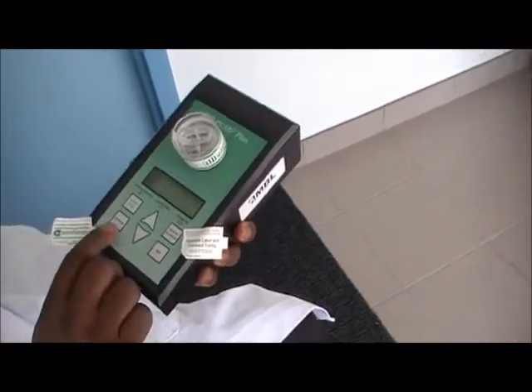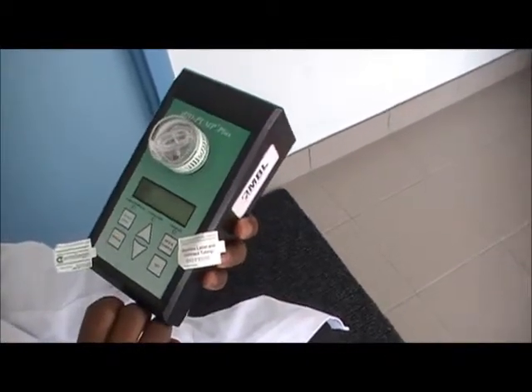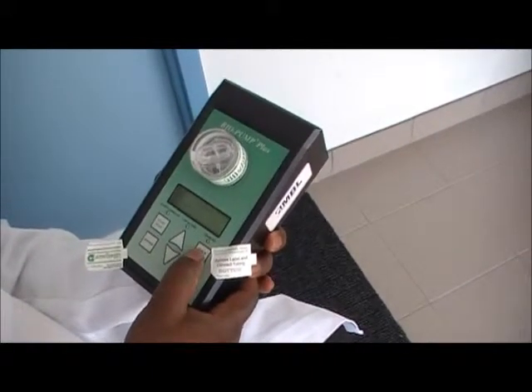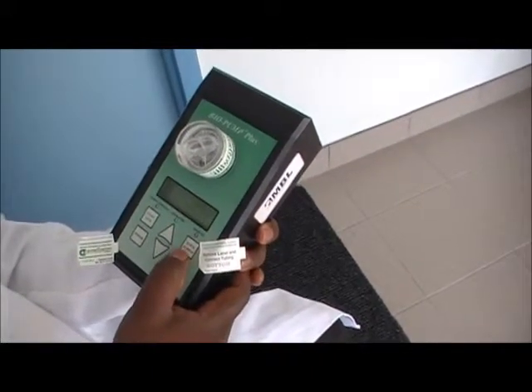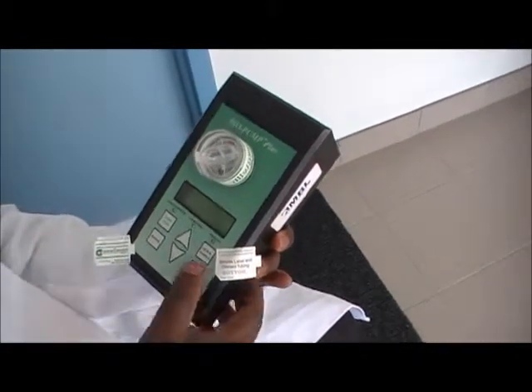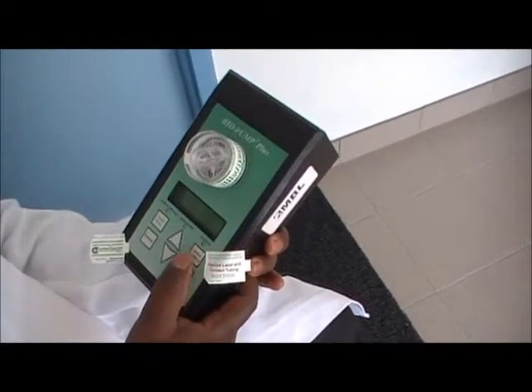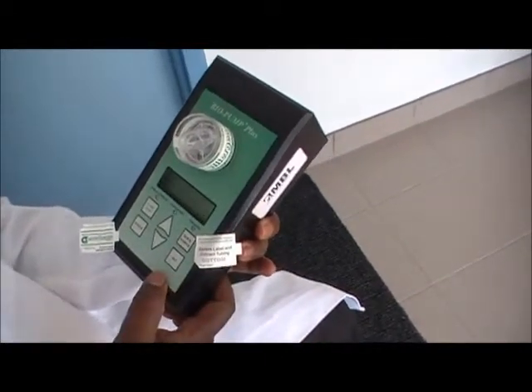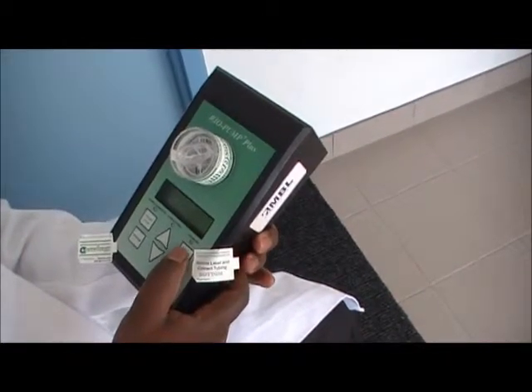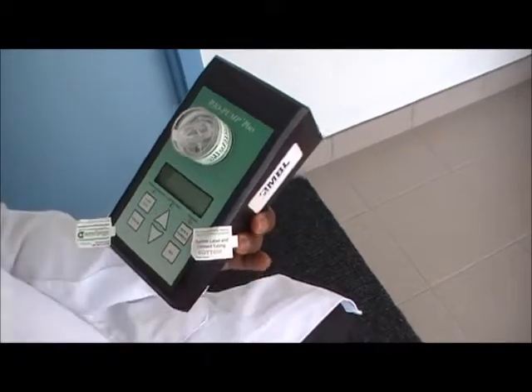The next thing you do is put on the power of the pump. After that you select quick sample. You can change the time — one minute, two minutes, five minutes, or ten minutes — according to what you want. For demonstration purposes we are going to do just a one minute sample.